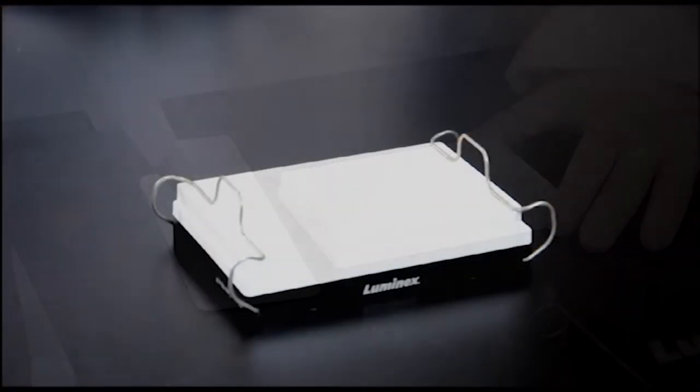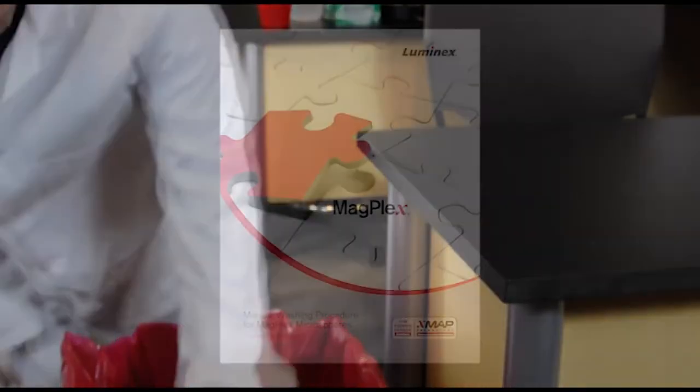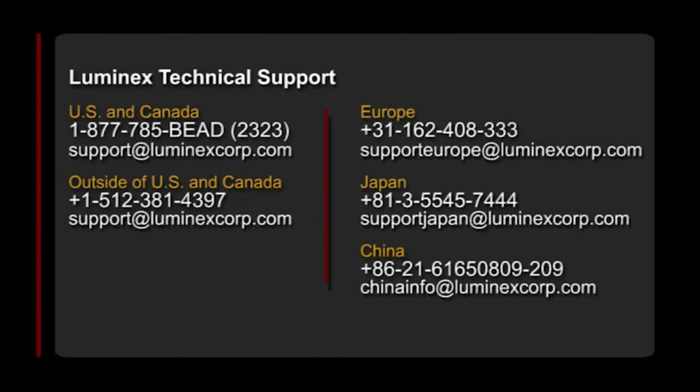Experimentation demonstrates efficient and effective evacuation of liquid reagents from the MagPlex Microspheres and assay plate wells using a rapid forceful inversion motion to remove wash supernatant. For more information, please refer to the Manual Washing Procedure for MagPlex Microspheres technical notes document. You can also contact us at the following locations.